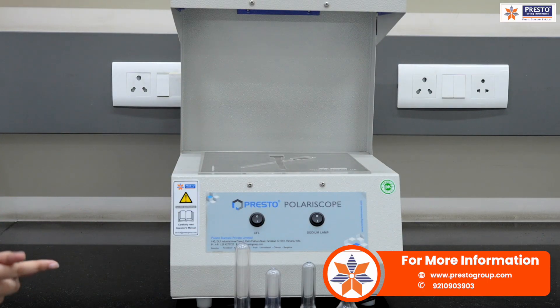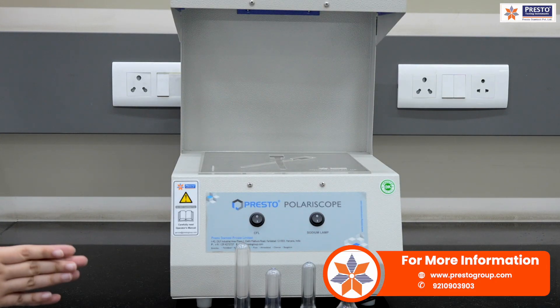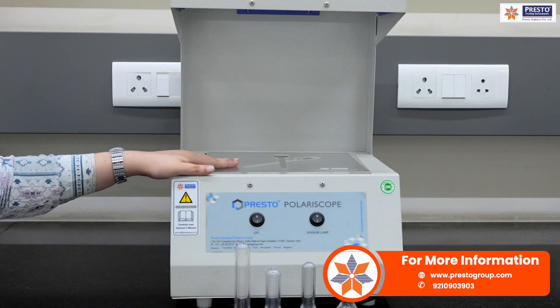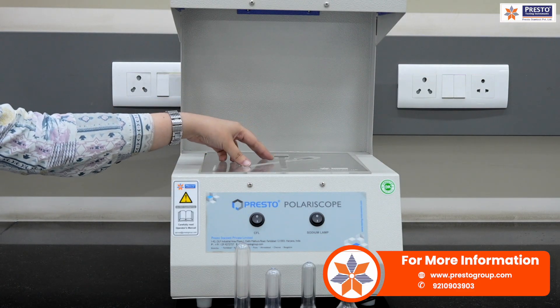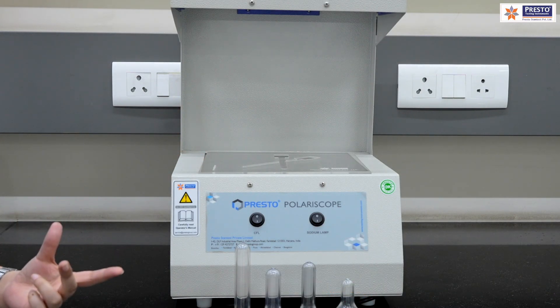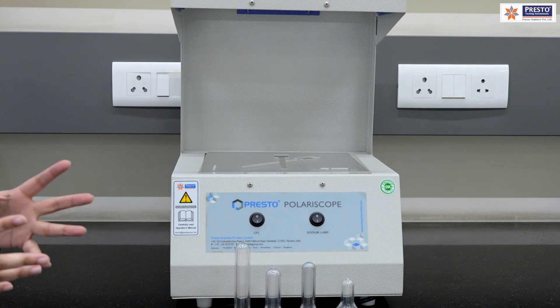The analysis we get is visual, and the instrument works on the birefringence principle, which involves double refraction when we switch on the two light sources. Light glows from this area and the sample is placed here. If stress is present in the sample, it will appear in the form of colors, splitting into two different rays showing different colors.